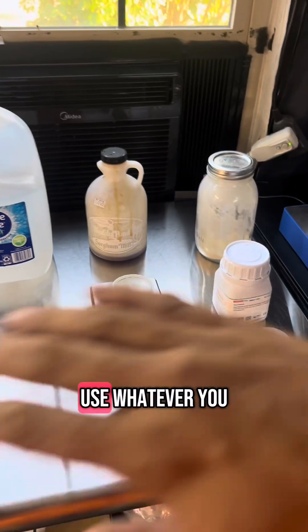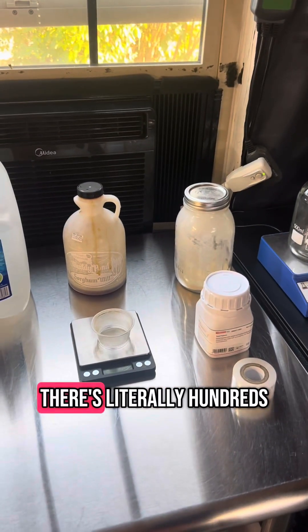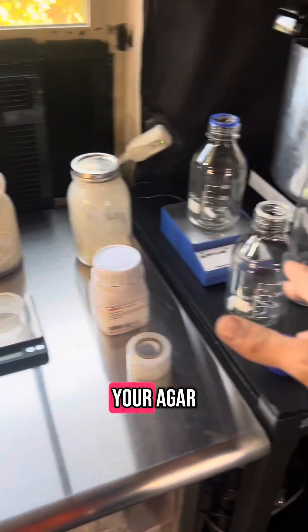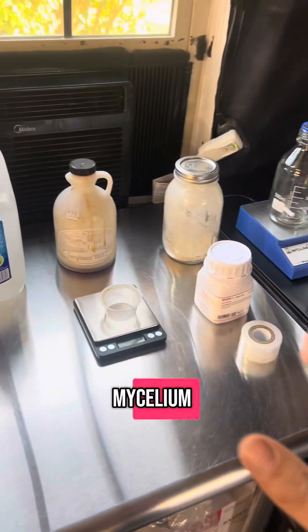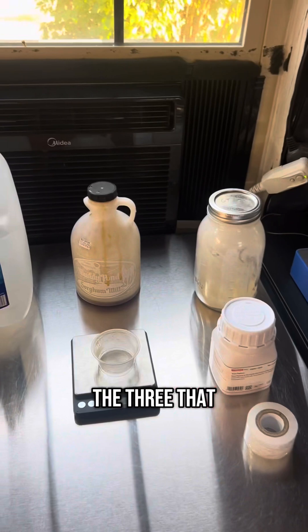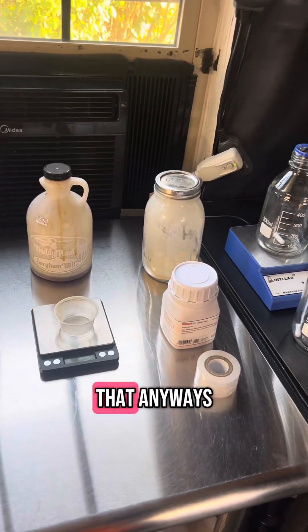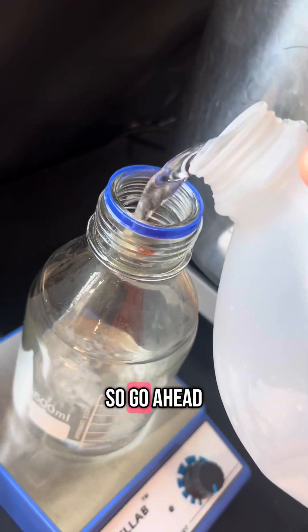As for the agar recipe, you can use whatever you want — there are literally hundreds of different recipes and different things you can use in your agar to grow out mycelium. This one I'm just going to use the three I've been using for a while, but I'm always changing recipes because mycelium loves that.